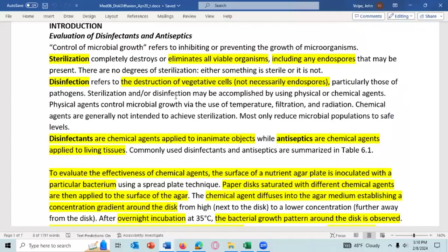And that is usually how in the microbiology lab we sterilize most agents. I suppose you could say with the inoculating loop, we do sterilize that by putting it in the incinerator or a flame, but most of the things are sterilized in the autoclave.